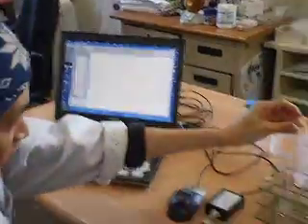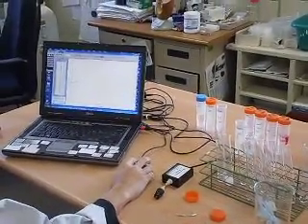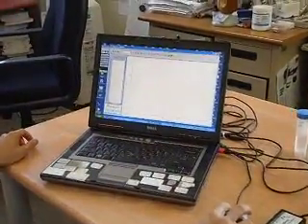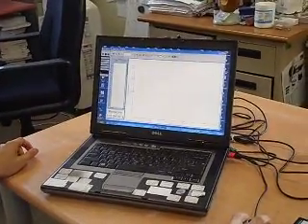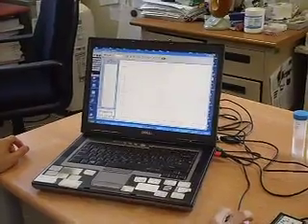Click on stop. Next thing now, I did experiment. Get into experiment. Store my latest run. So I have got two data now. This one here, which is red in color, represents the reaction at higher concentration. This is at lower concentration now.